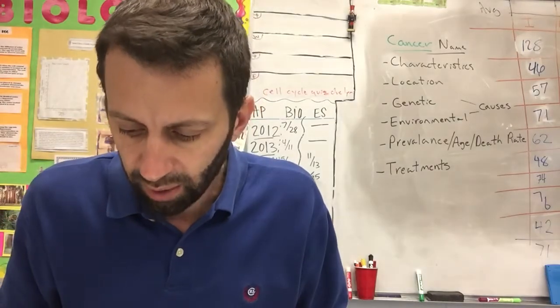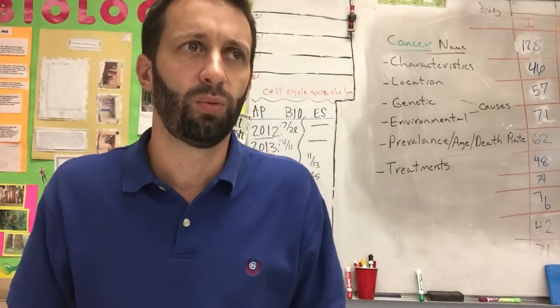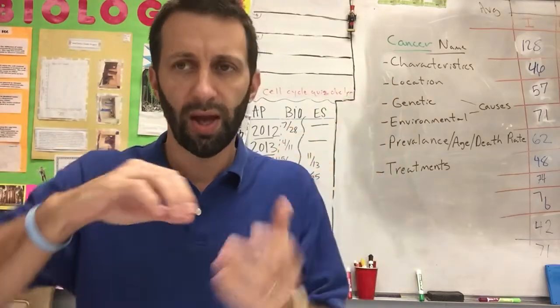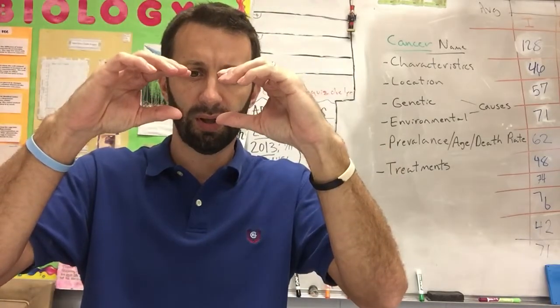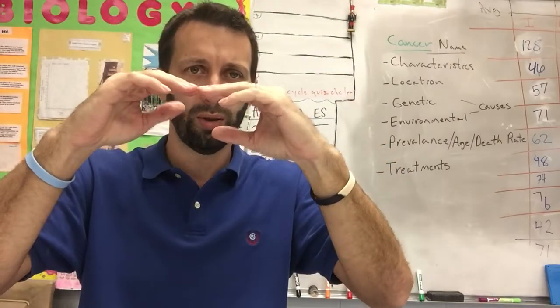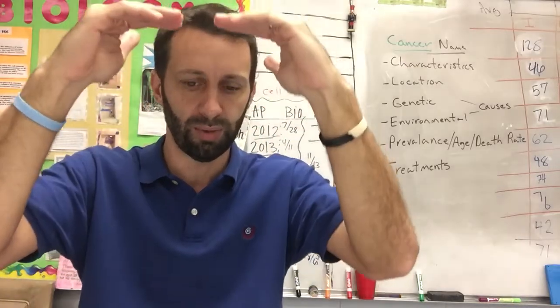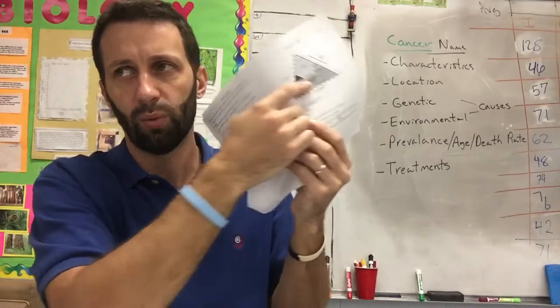You do need alum. Alum is called a flocculating agent, which is a big fancy term for it helps light particles clump together. So what's going to happen is when we mix our dirt in there, the sand is all going to clump together and settle out, and then the silt, and then the clay. And so you're going to wind up with 3 very distinct layers, and you're going to be able to measure them on the graduated cylinder. How much sand, how much silt, and how much clay. And then you can use your triangle to figure out what soil you have.